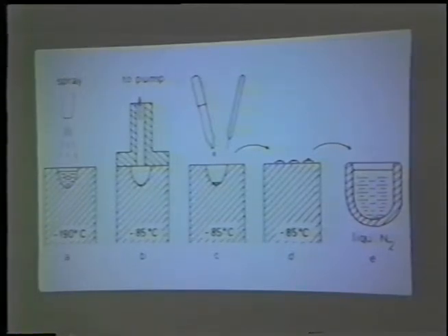So that limits the kinds of systems you can work with right there. If you're doing freeze fracture, the number of droplets that you get in any given fracture through the butylbenzene is pretty small. So here you have a large field of butylbenzene with a few droplets in it. Inside the droplets, there aren't that many cells. So the chances of seeing a cell are pretty small.